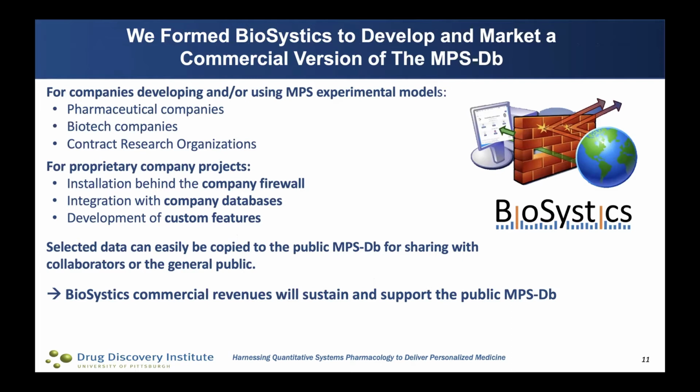And the commercialization of the MPS database will generate revenues that will support the public MPS database. And so the goal is really to make the public MPS database be a self-sustaining database.